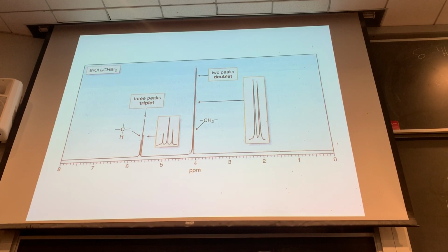What I just showed you here with the spin up, spin down, and probabilities holds there. And you see a nice triplet, where the peak in the middle is what? 2 probability states. 2 down or 2 up, or just 1 probability, and then the middle one there. Sometimes the heights are a little bit different.